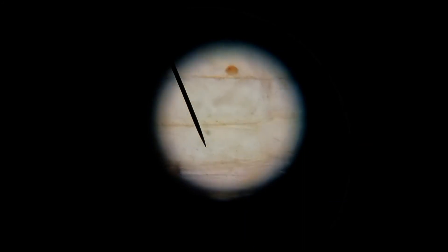It's a bit of a full-on cell there, isn't it? And there we go. There we have a couple of cells in view. Beautiful.